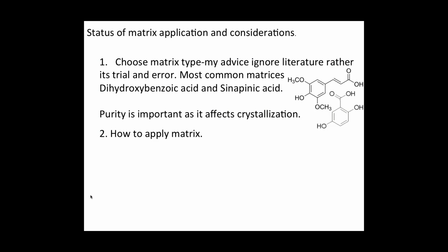Purity, I think, of the matrices is an important consideration, as purity affects crystallization. We have a really hard time in imaging mass spectrometry, particularly when you apply matrix, to reproduce some of the results. And I think part of it, even when you use the same matrix, if the purity is very different, or the solvents that you're using to promote crystallization are different, you might get slightly different crystal forms and size of crystals, and that affects what you're going to see.